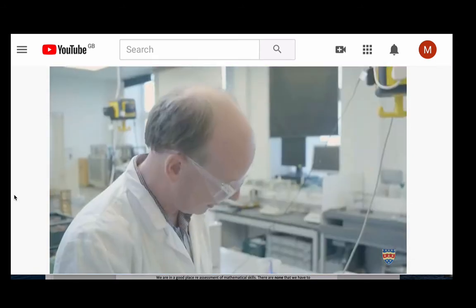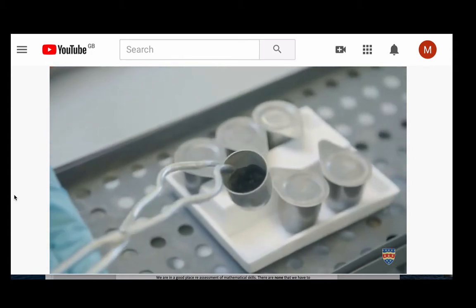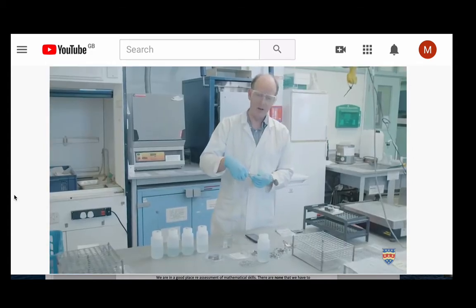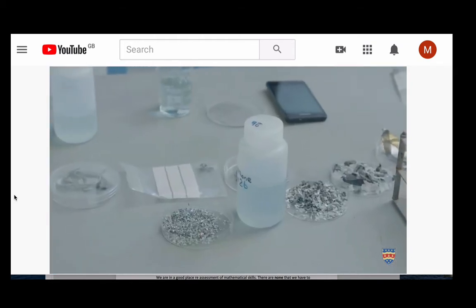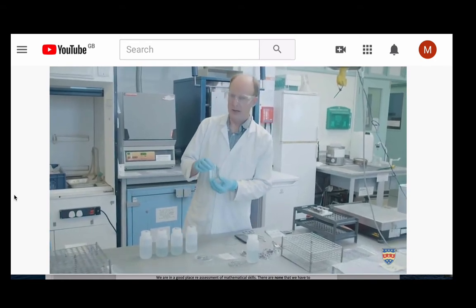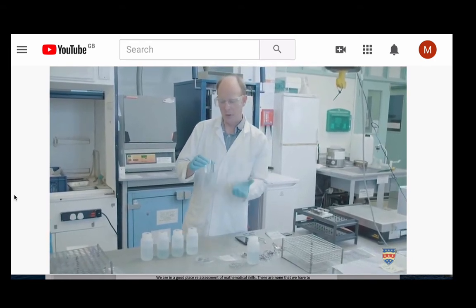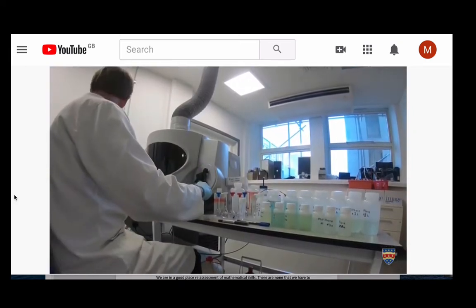I think that looks good. It's nice and black and dark and sort of a bit molten, but what's great about this stuff now is that we can take this to the lab and dissolve this very easily in some weak acids. This solution we can actually analyze the contents of all the metals and all the elements that are in here in a mass spectrometer here at the university.